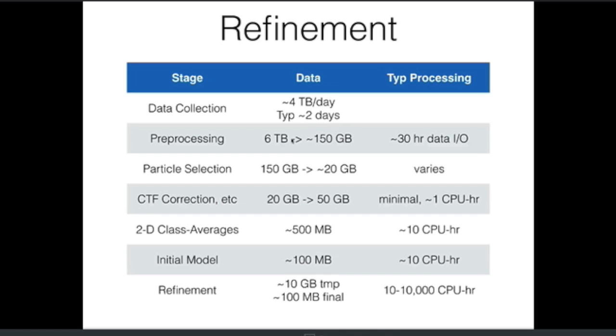So there's very little point in trying to go to a cluster for any part of this process, because the drive will read the data as fast as it reads it. It's not gonna speed up anything. Now, some sites you'll find they actually have a dedicated 10 gigabit data line from the microscope to another computer where they can do the pre-processing, and then they'll just give you the 150 gigabytes when you go back home. But still, people very often want the raw data because they say, well, maybe they'll come up with better algorithms for processing, that sort of thing.